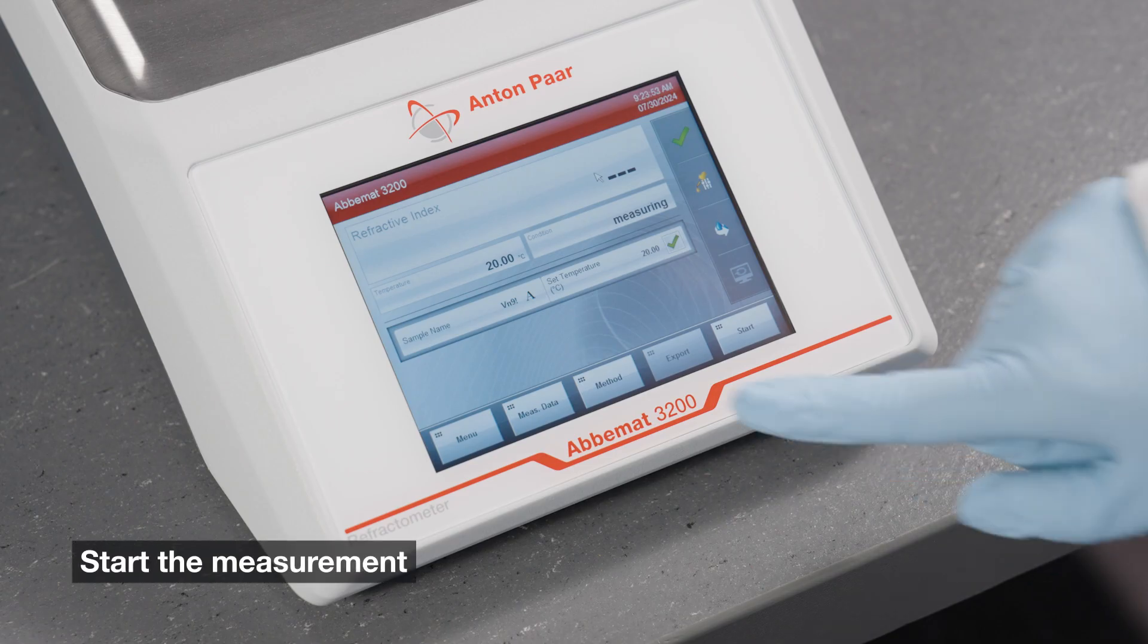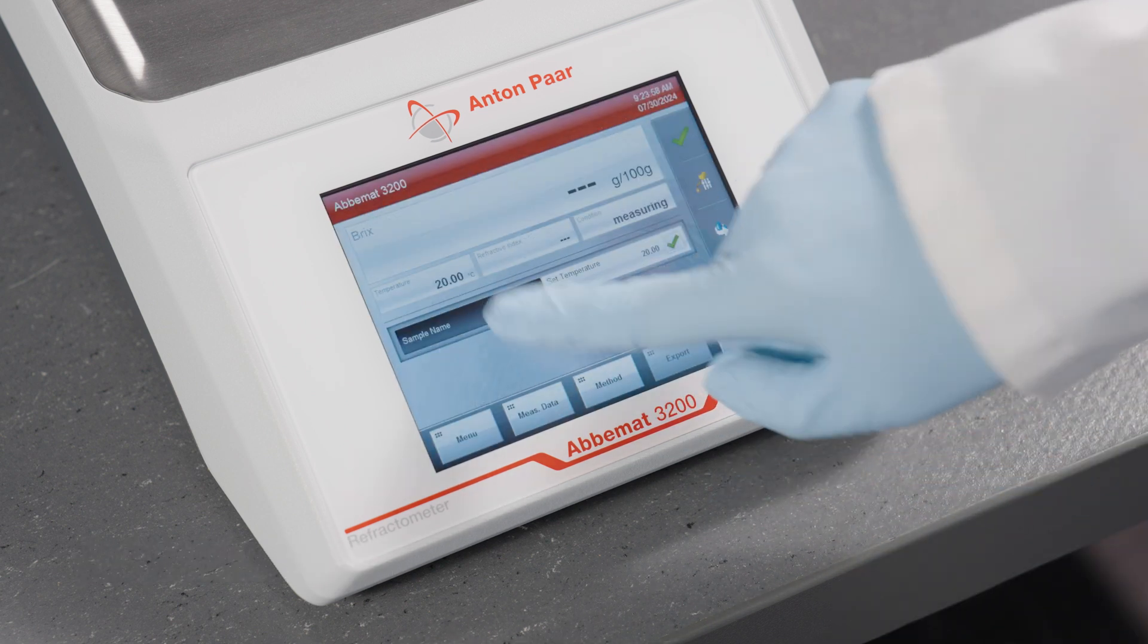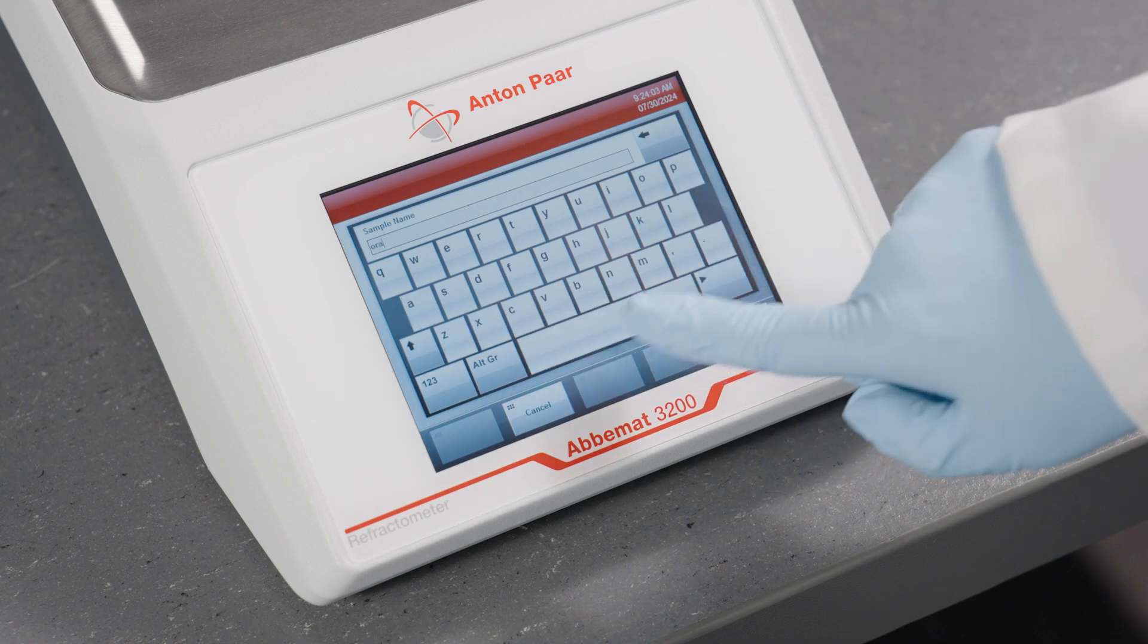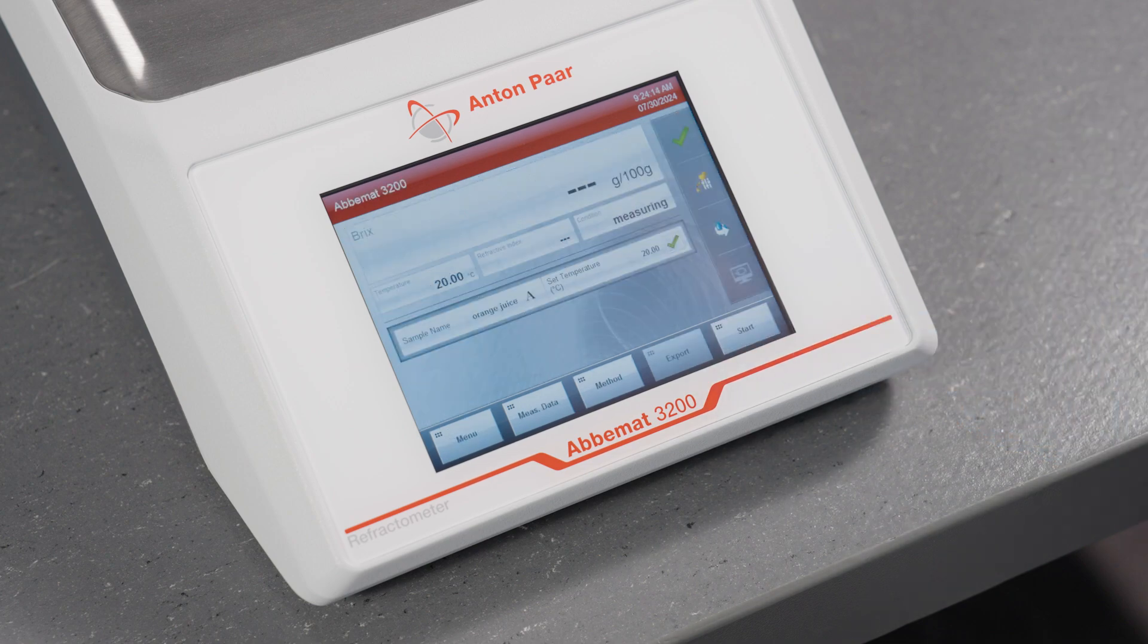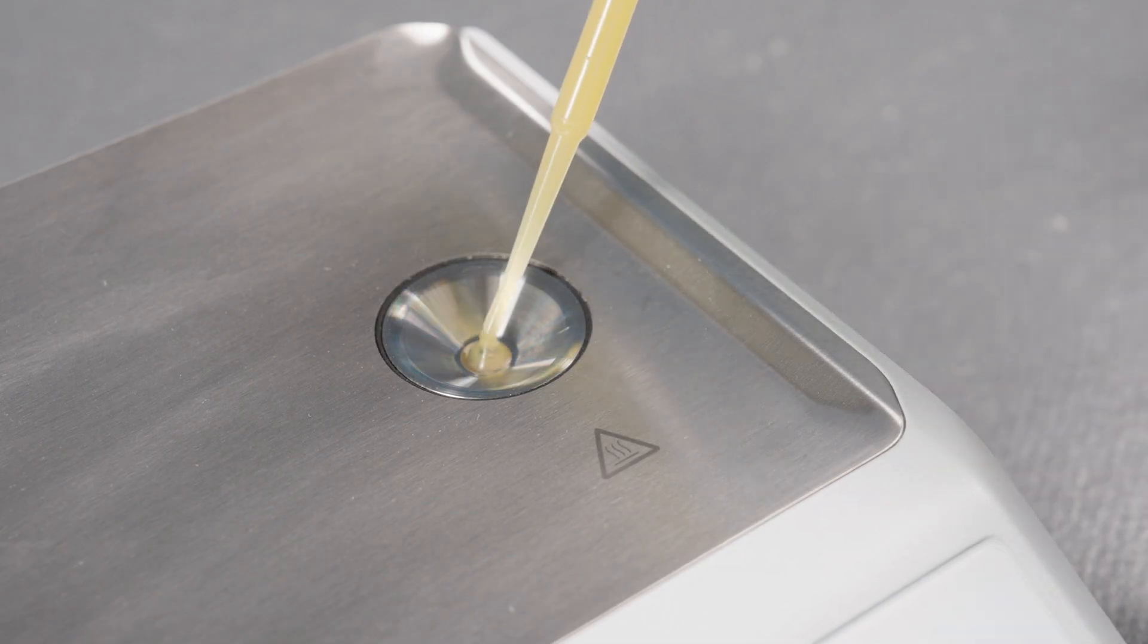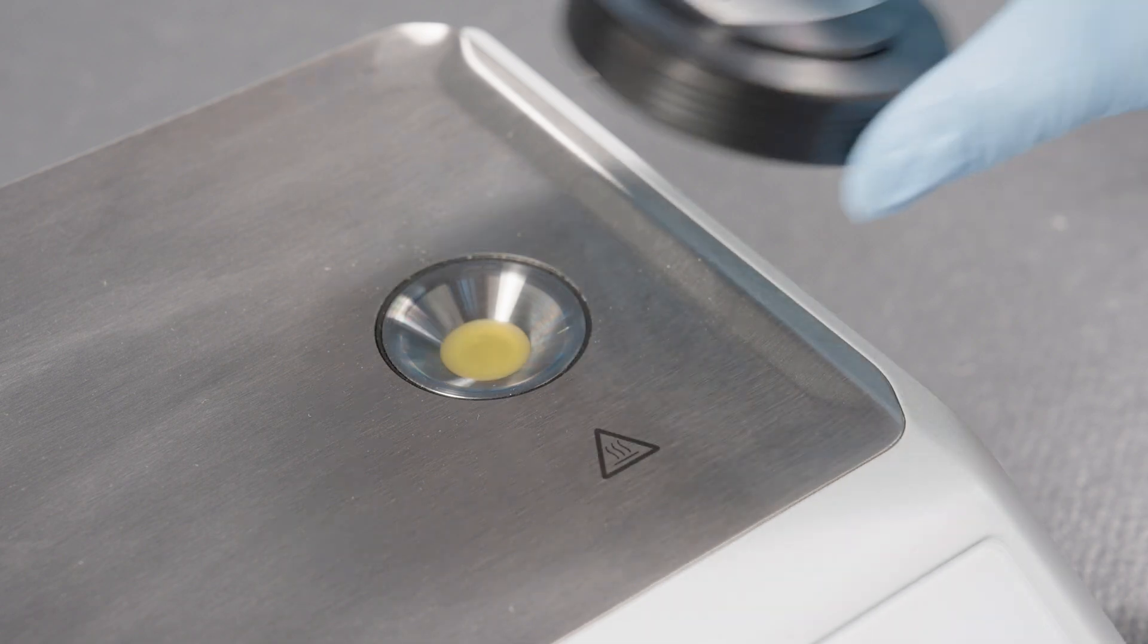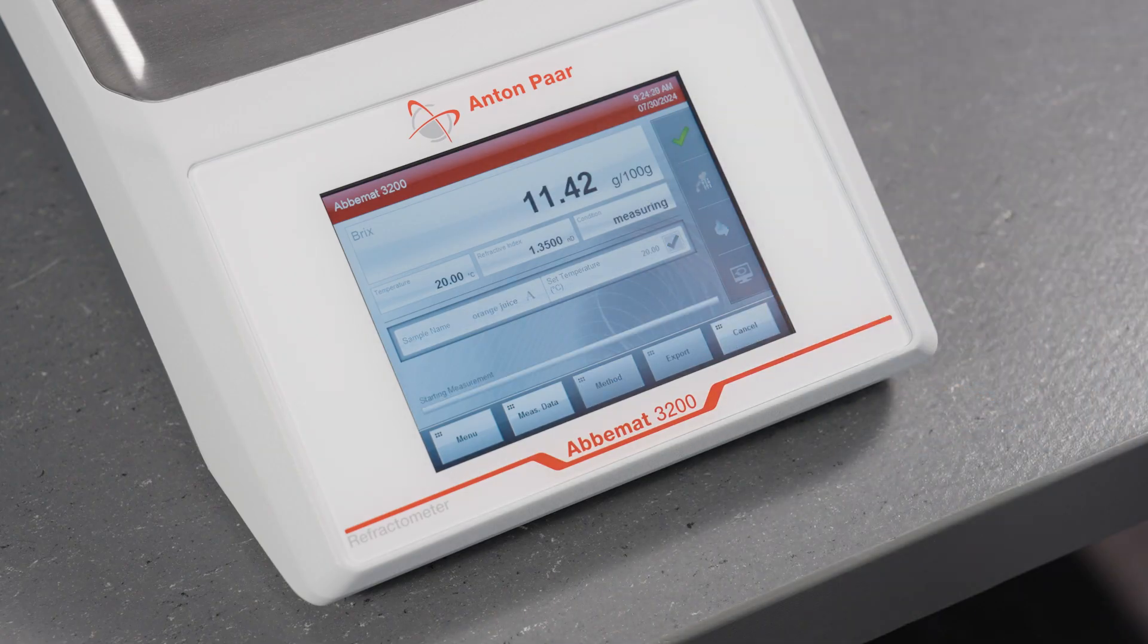Select the desired method by tapping Method on the main screen. Enter a sample name and apply the sample. Press start and wait until the measurement is finished.